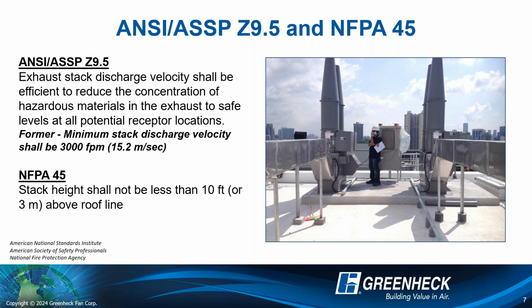And we also want to make sure that when people go up on the roof that maybe aren't too familiar with these laboratory exhaust systems, they don't have a chance to stick their hand or their face or whatever else over these fans. Because as we said before, most of the time, whatever these fans are exhausting is extremely hazardous. And if they come in contact with whatever's being exhausted, it could potentially be deadly. So we want to make sure that, 10 feet tall minimum, that's what we're sticking with.